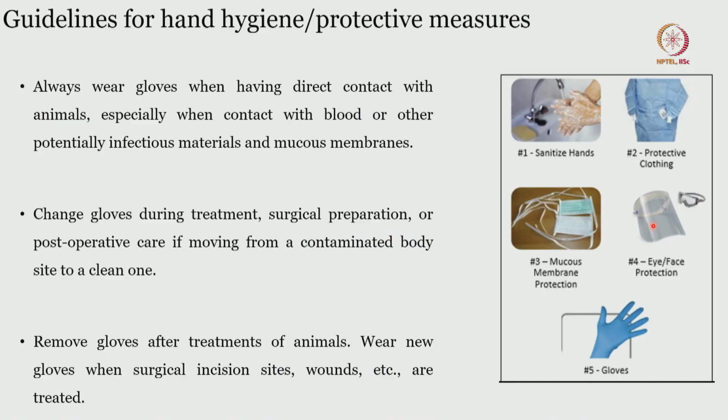So once the gloves are worn, you are ready to go ahead with the surgery. But apart from it, it is always better to maintain the safety measures which I just said, and you need to wear gloves whenever there is direct contact with animals, especially when you are trying to collect blood, and maybe you think that the rat is not really doing great and maybe there is an infection. All the time you need to wear the gloves, all right.